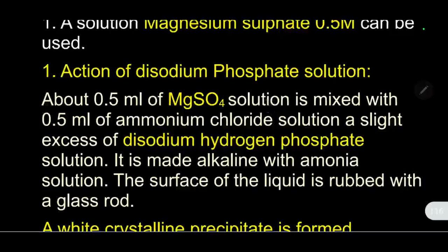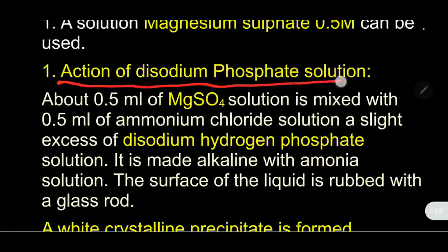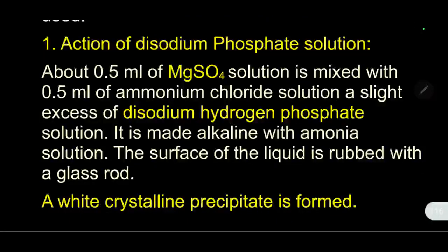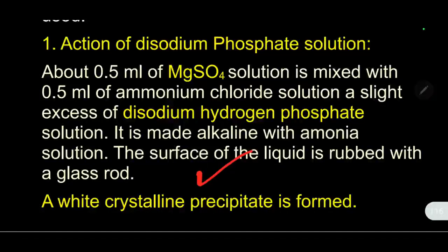The first test is the action of disodium hydrogen phosphate. About 0.5 ml of magnesium sulfate solution is mixed with 0.5 ml of ammonium chloride solution, and a slight excess of disodium hydrogen phosphate solution is added. It is made alkaline with ammonia solution. Then the surface of the liquid is rubbed with a glass rod. A white crystalline precipitate is formed in the test tube.